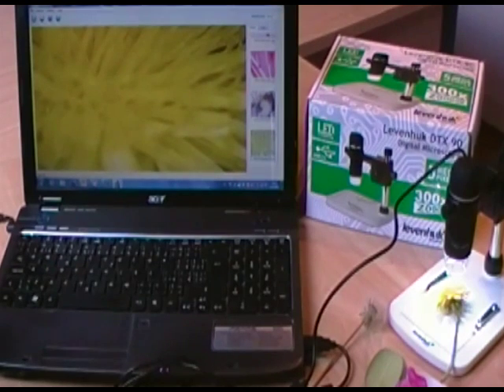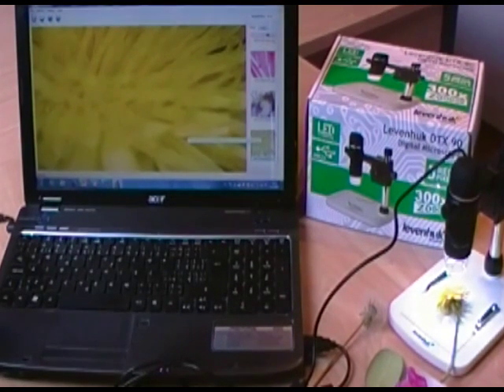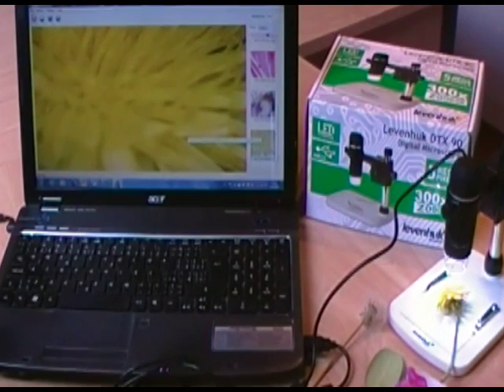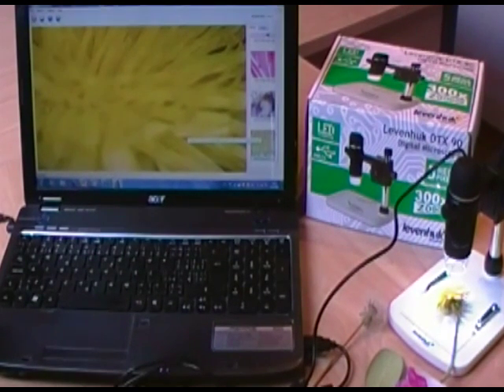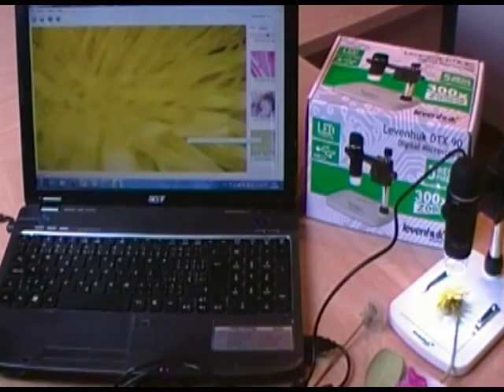This microscope has the ability to work with a PC and, for example, for an interactive whiteboard presentation. It is very easy to work with.